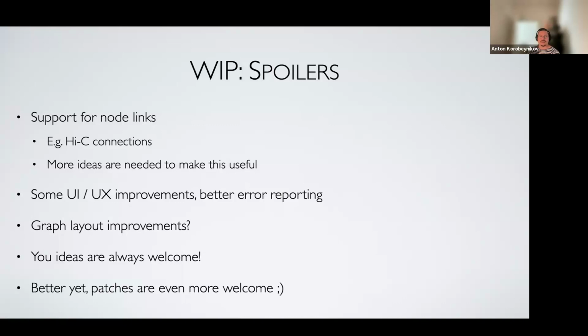In any case, any ideas are always welcome, because I really want to have a useful tool. It's more of a pet project, so I'm not interested in publications and graphs or whatever. My only aim is to have a tool that might be useful for the community and for other researchers. So the more ideas the better. We can try to work together to see if something you want to add could be made generally useful.